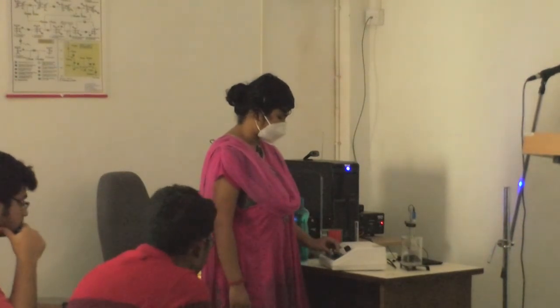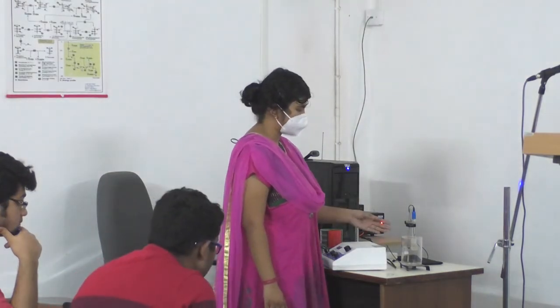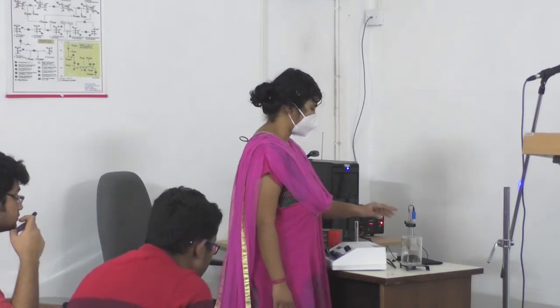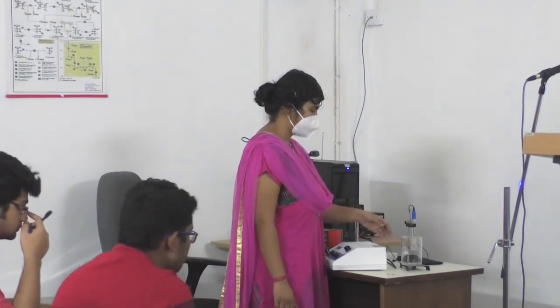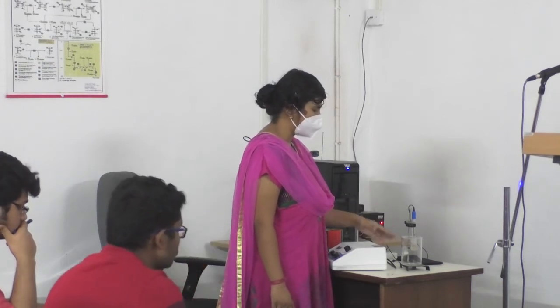And also using the calibration knob, we calibrate it, and again we repeat the same process by taking off the electrode, cleaning the tip of the electrode with tissue paper, and using it in the neutral buffer solution. Again, similarly we calibrate it so we can get a range.